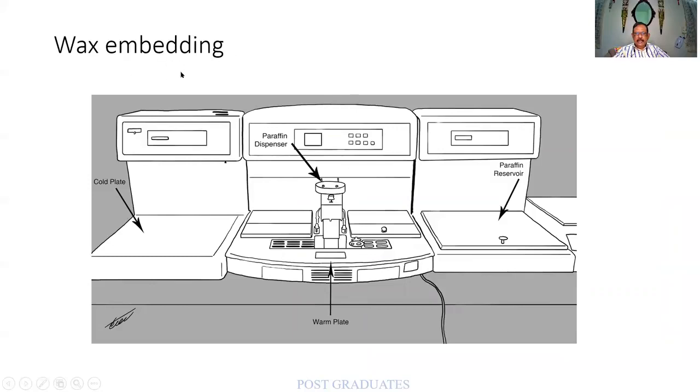There is also a wax embedding machine. Molten paraffin is placed and the tissue is inserted with a compression, and a wax block is produced. There is a paraffin reservoir with vacuum creating additional pressure. Ultimately you get a tissue block or wax block, which is then kept on a cold plate to solidify.